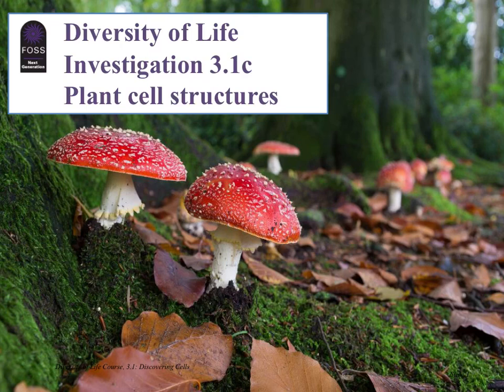Diversity of Life, Investigation 3.1c. This is on plant cell structures. If you'll recall from our last lesson, we were looking at some of the cell structures inside an Elodea plant.